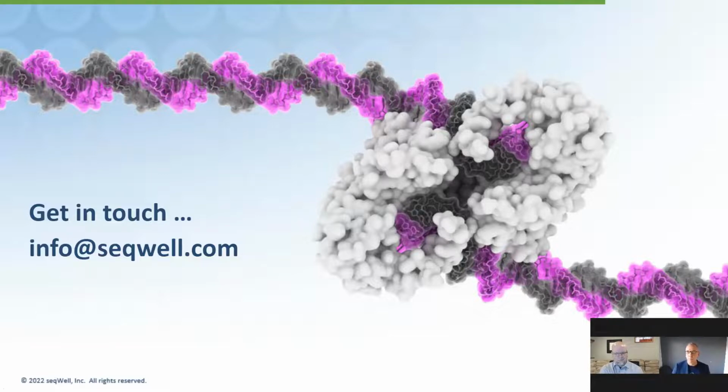Where do we see some of the newer sequencing platforms using TN5 transposase-based technology to scale up larger volume projects? Yeah, again, thank you for the question.